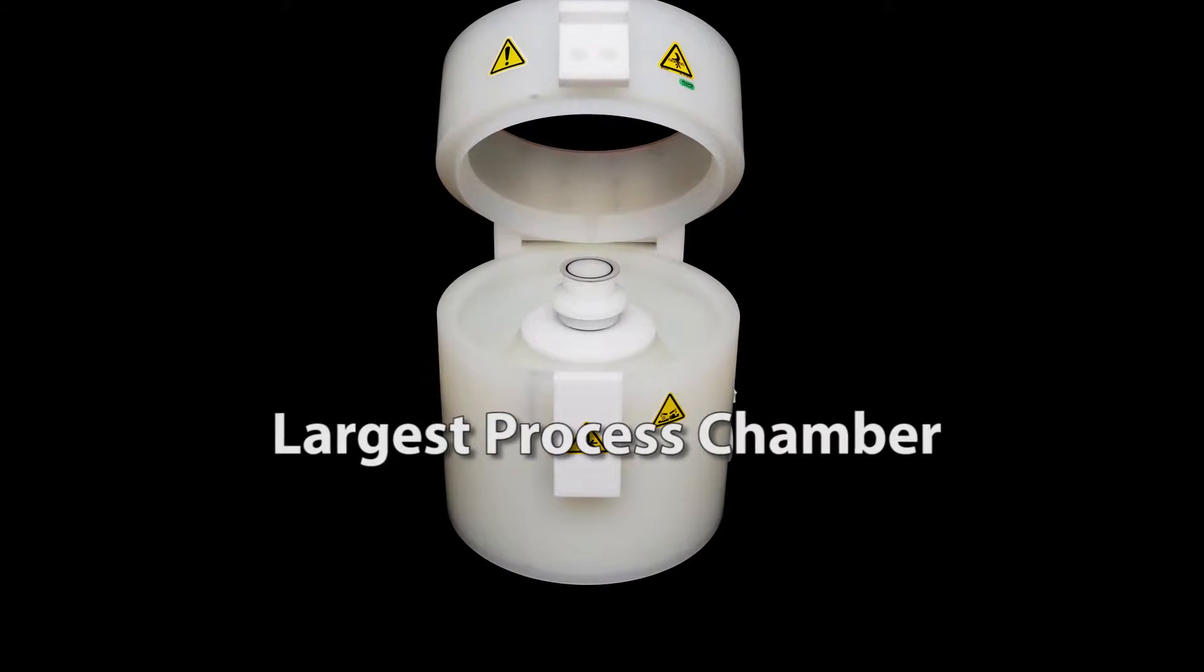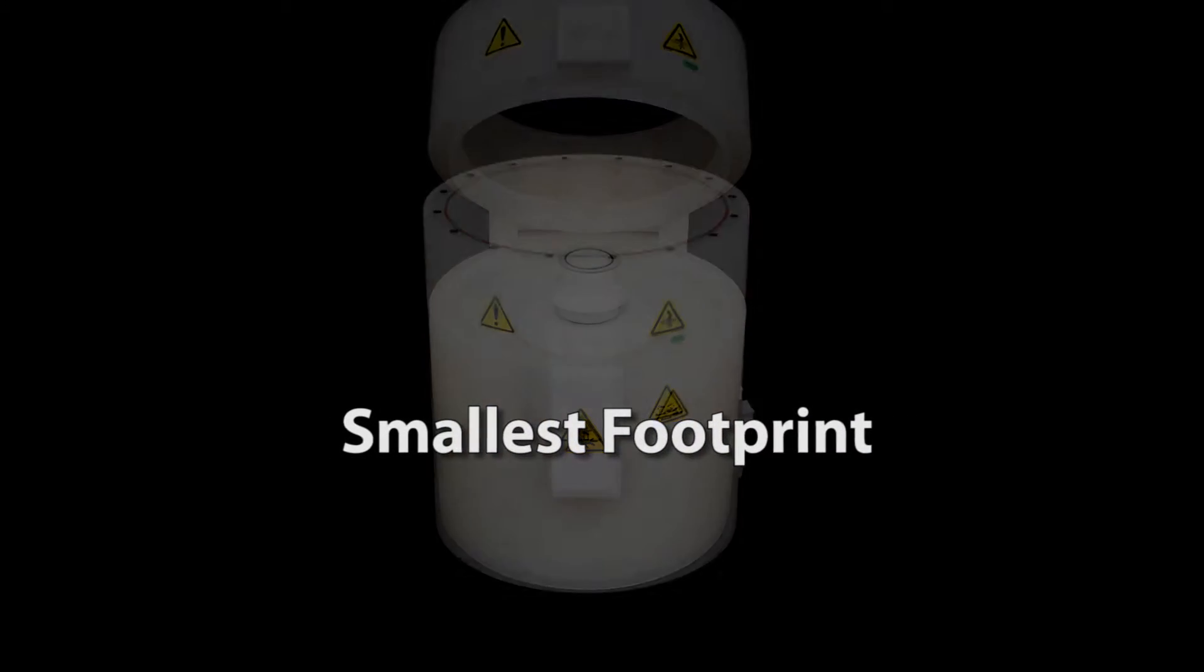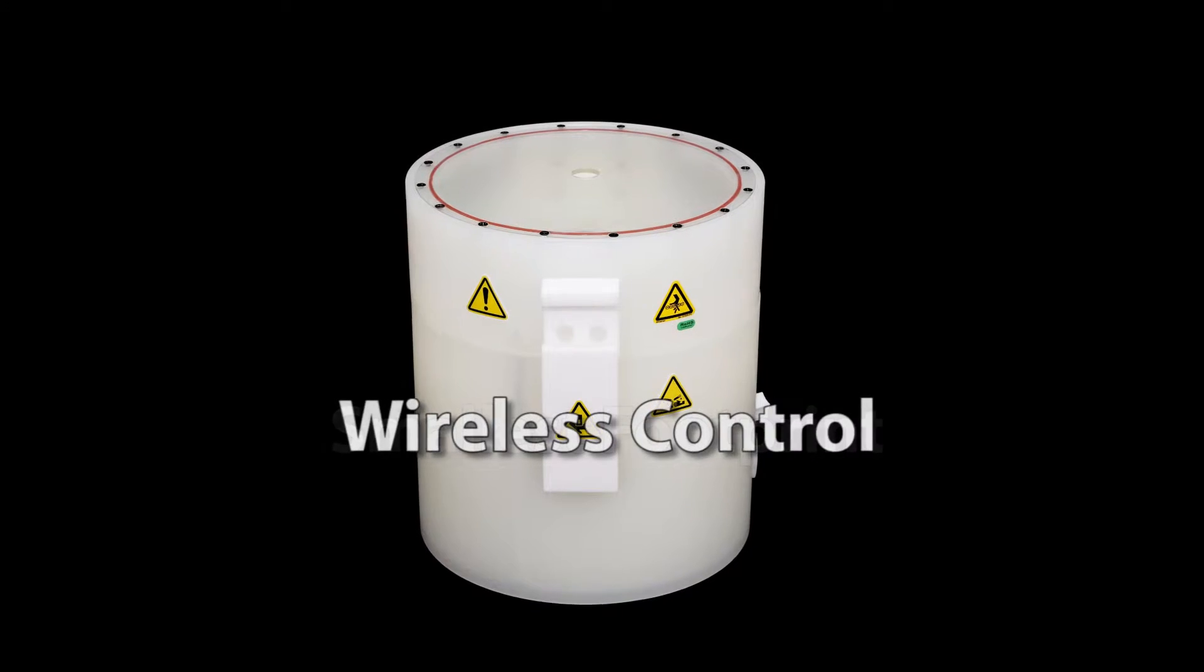We have the largest process chamber, smallest footprint and wireless control.